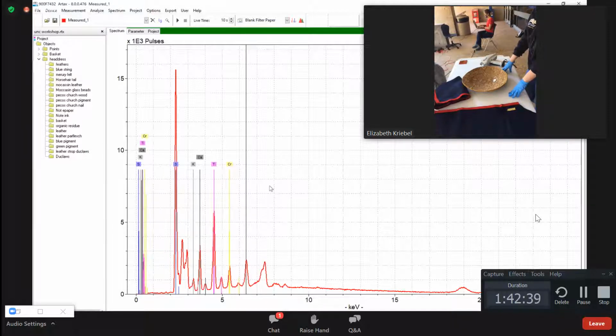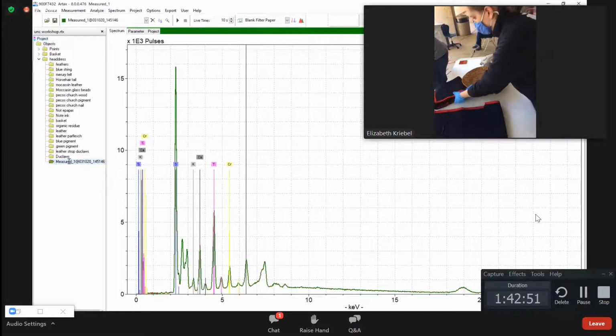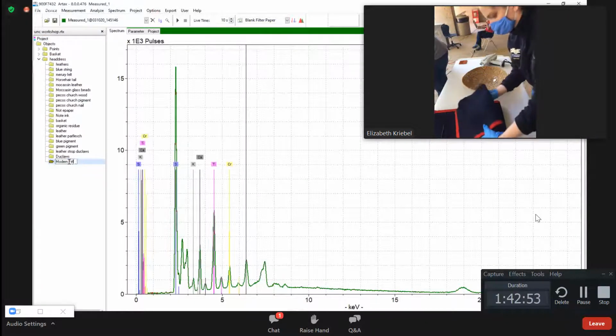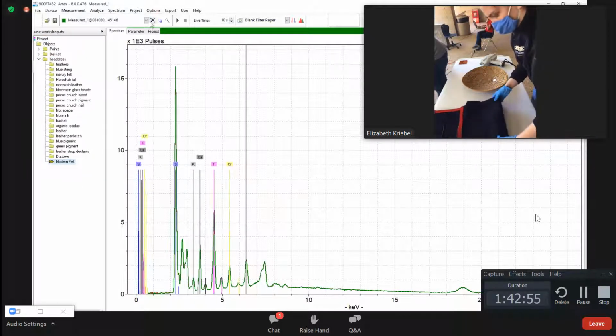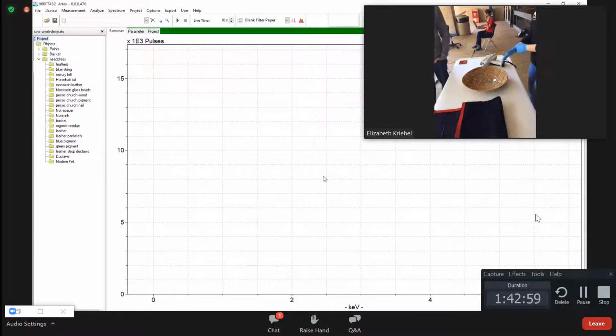So I don't know that we need to measure the red. This is modern. They did not put anything dangerous on this at all. I think it could be from the 1970s. But that gives us peace of mind. All right, so we're going to call it modern. Once again, the reason we can tell it's modern is the high quantities of titanium, just because titanium wasn't synthesized until the early 1920s.